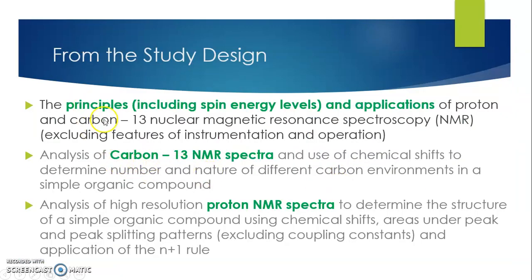So from the study design, we need to know a lot about this particular technique. But in this particular video, we'll only cover the principles and the two kinds of spectroscopy that we need to know for NMR. One is carbon-13, the other one is proton NMR.